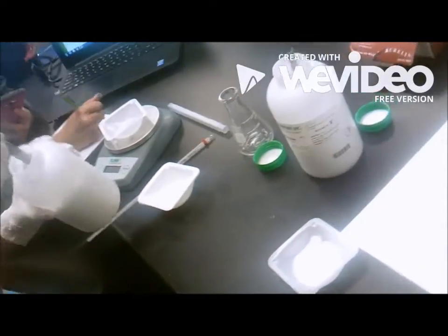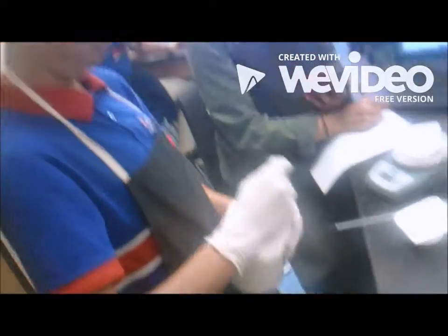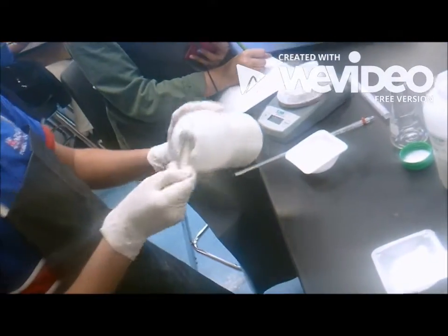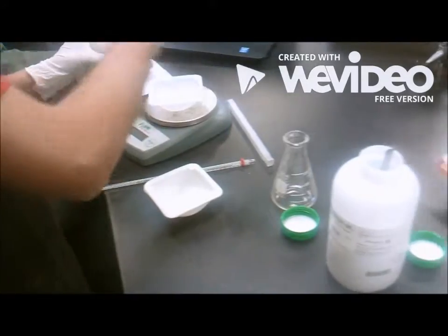For this experiment, you will need a 125 milliliter Erlenmeyer flask, stirring rod, a temperature probe, insulating gloves, water, a block of wood, 10 grams of ammonium thiocyanate, and 20 grams of barium hydroxide octahydrate.